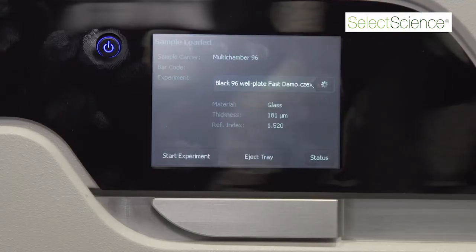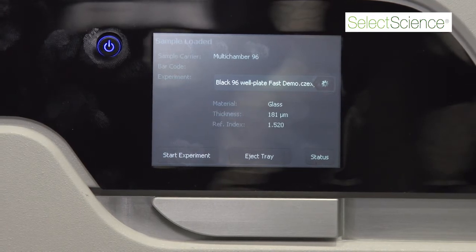The Cell Discoverer 7 is designed to do live cell imaging in an automated fashion, so that you could do well plates or slides or dishes without having your time taken up by the imaging.